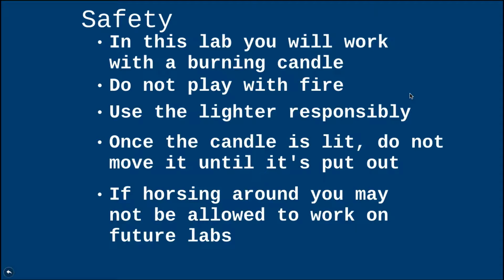Now, if you ignore all of these warnings and you decide to be playing around, guys, that's a very big danger in a chemistry lab. And so, if you show me that you can't be responsible with just a simple candle, then I can't really trust you with other more dangerous experiments. So, if I catch you horsing around today, then later you may not be allowed to do all the other labs we'll be doing.